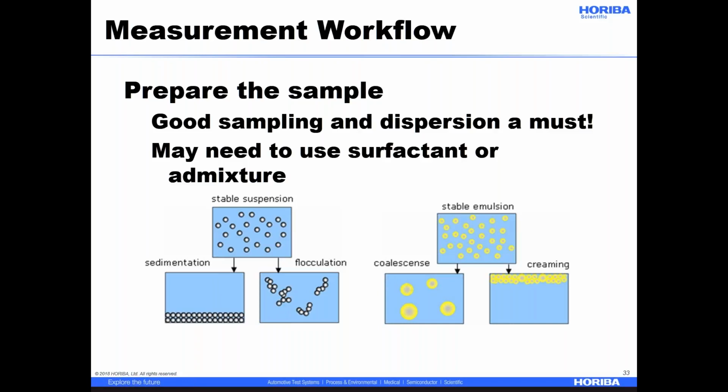And this is an advantage of laser diffraction over, say, dynamic light scattering, where you really can't mix a sample during a DLS measurement. Let me phrase that more carefully. You can mix, you'll just get the wrong answers.